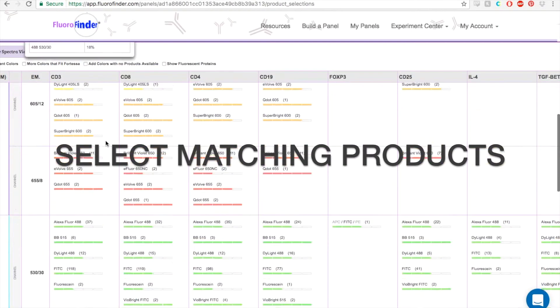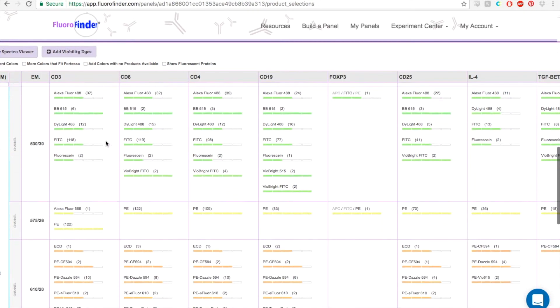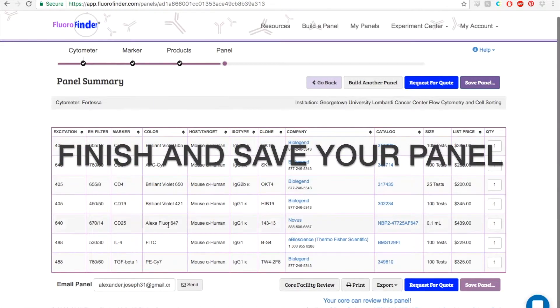As you build your panel, Fluorofinder will automatically update these results and block equivalent and overlapping colors.